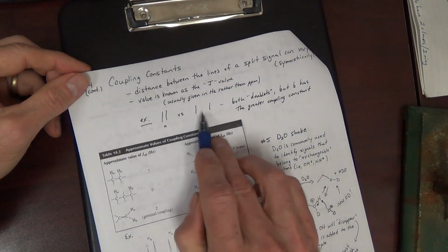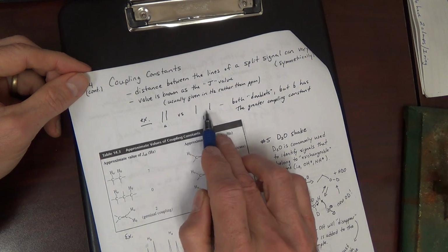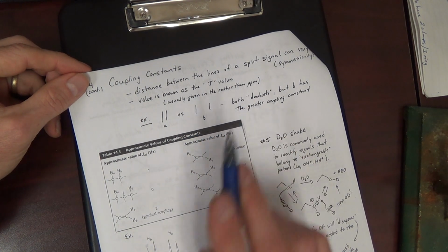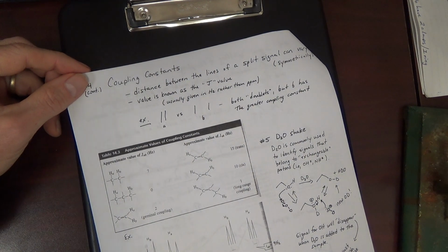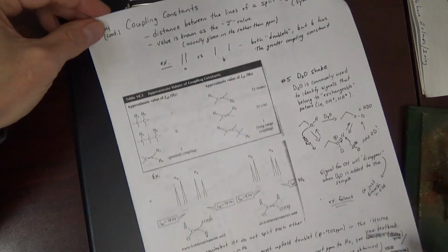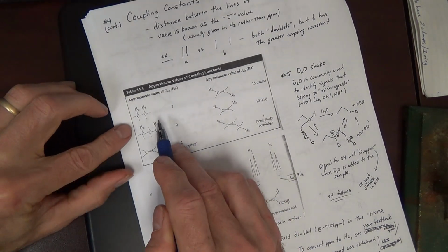Now, the distance can be stated or given. It's usually given in hertz rather than ppm. We'll look at an example. First, let's just look at a table of coupling constants.